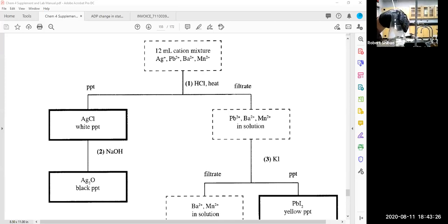Okay, so here goes. All right. When you take a look at that, there's quite a bit of yellow-orange precipitate that's just formed. And it gives a cloudy suspension like that. I've got to make sure I get all the lead precipitated that I can, so I'm going to add some more. Then let this sit.